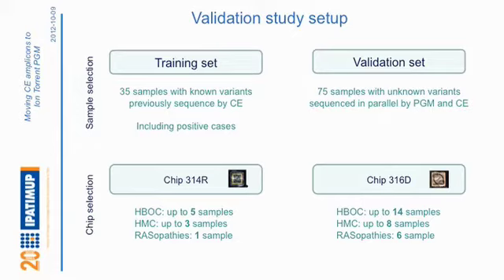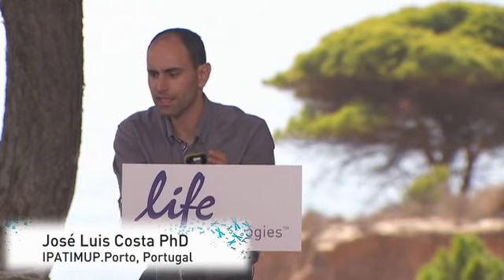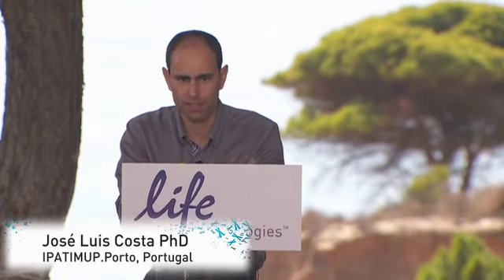At the bottom of the slide here, you see that for this study, we basically used only the 314 and the 316 chips. We haven't run a single 318 in our lab yet, and I think it will take a lot of time to run one of those. We need a lot of throughput to get a lot of samples to be run at the same time on a 318. But at least you get an idea here of how many samples one can multiplex in a single chip and run at the same time.